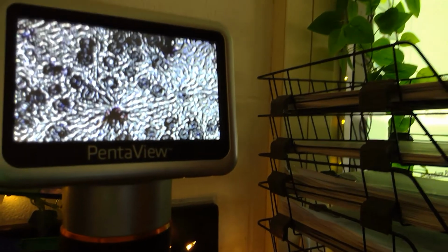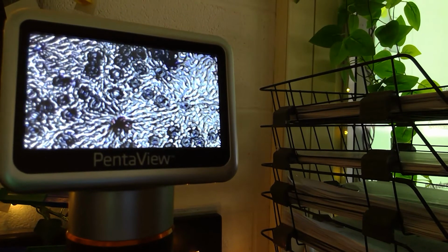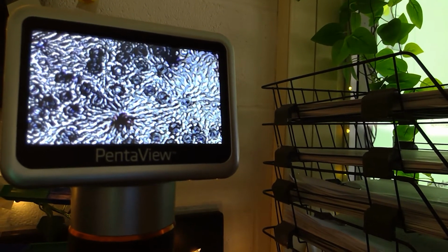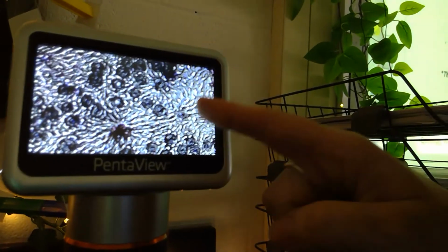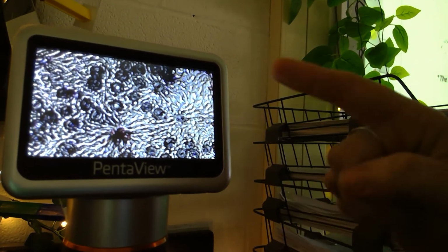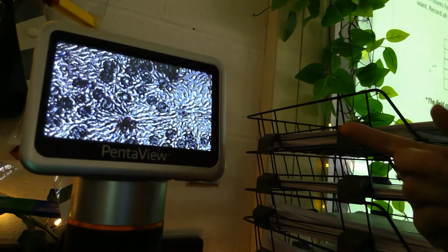my sample. And I'm gonna count 1, 2, 3, 4, 5, 6, 7, 8, 9, 10, 11, 12, 13, 14, 15, 16, 17, 18, 19, 20, 21, 22, 23, 24, 25, 26, 27, 28, 29, 30, 31, 32, 33, 34, 35, 36 is what I count for that one. Okay, so I'm going to write that down.